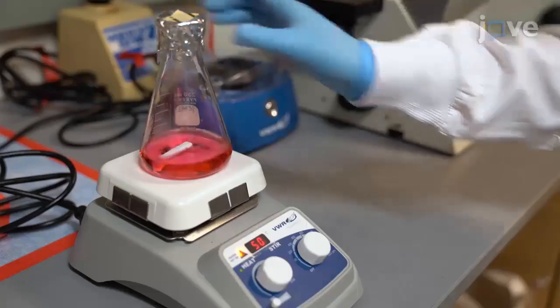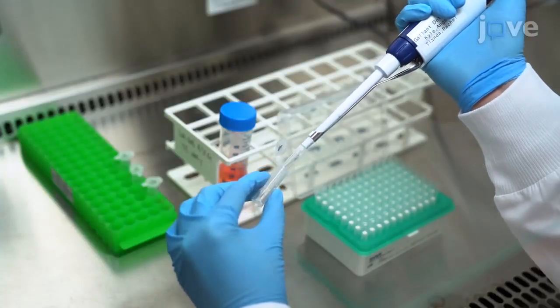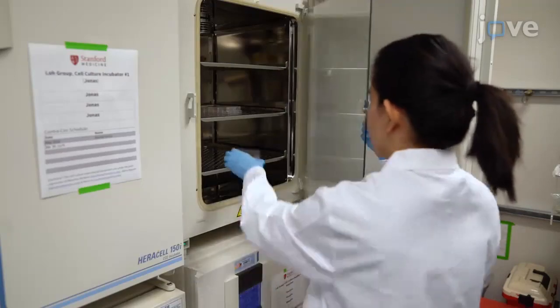This method enables the generation of large numbers of human liver bud progenitors and hepatocyte-like cells with high purity. The ability to generate these liver cells could be important for regenerative medicine and other fields.